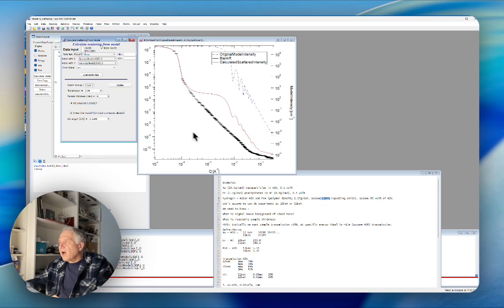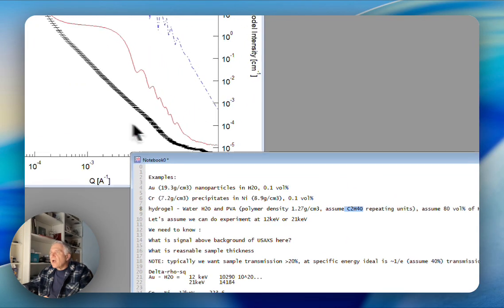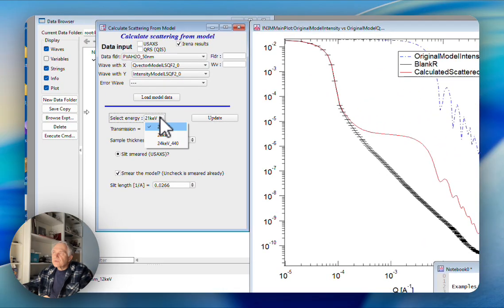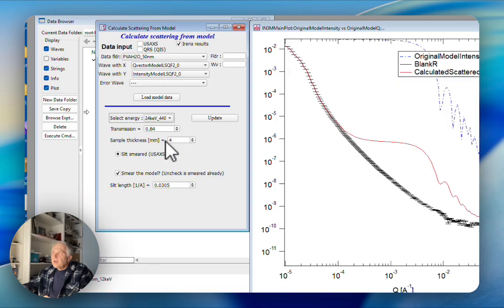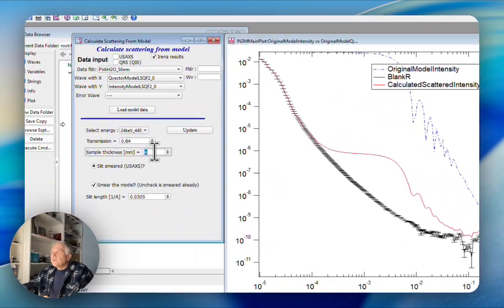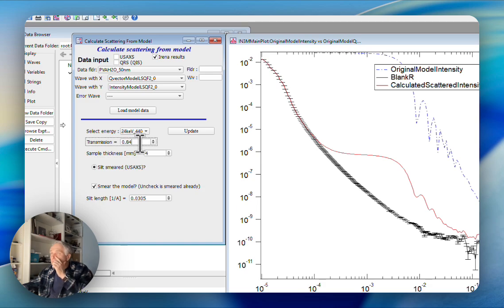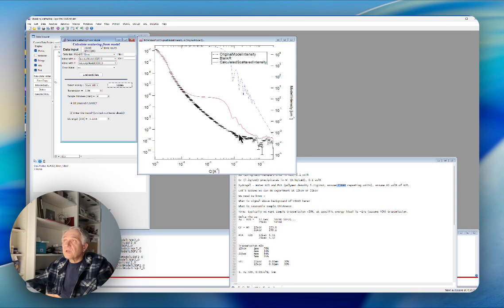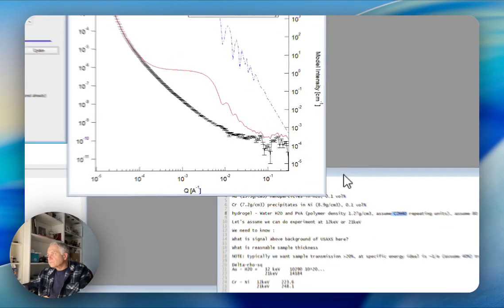Anyway, if you decided you want to measure this in the high resolution mode, you can do high resolution mode, and that will look like this at 4 millimeters and 84. So you can see that you could measure this even on a 4 millimeter high resolution mode, which means you might be able to see some large structures in there.